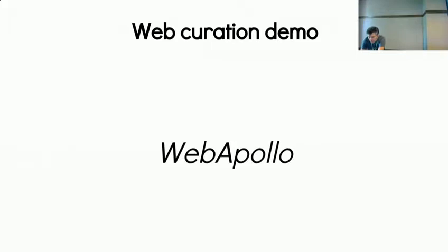Additionally, like I said before, you have the ability to change the type, and this is of course reversible. By default, when you drag up an element, you can see where different elements are overlapping. They're mRNAs by default. So let's go in here. This is the different color scheme, I think. I don't know if it's exactly what you want, but it's a different view of the sequence data.